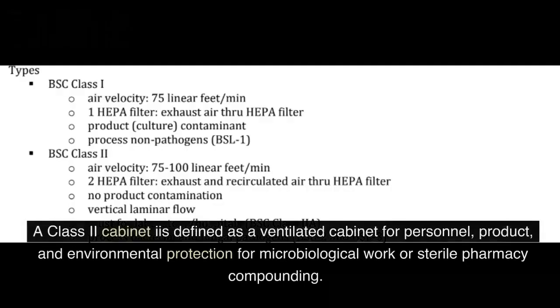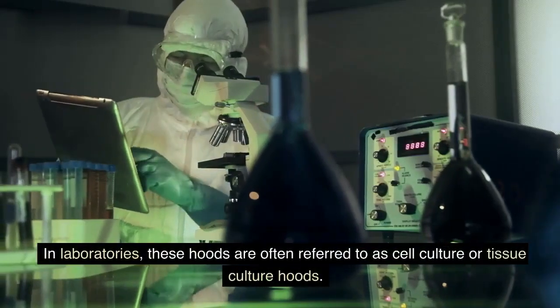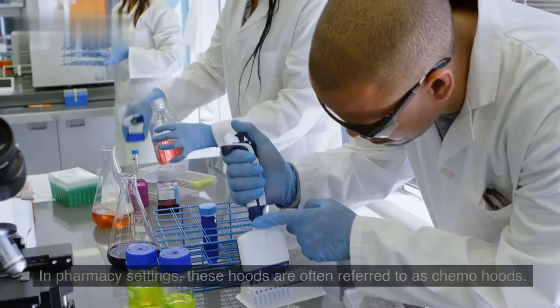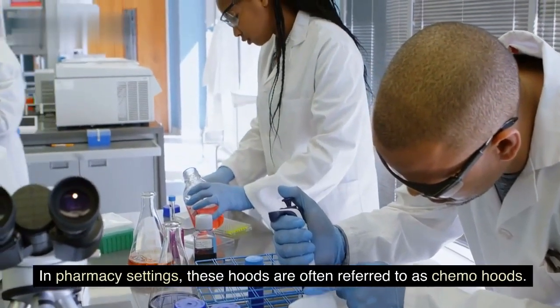A Class 2 cabinet is defined as a ventilated cabinet for personnel, product, and environmental protection for microbiological work or sterile pharmacy compounding. In laboratories, these hoods are often referred to as cell culture or tissue culture hoods. In pharmacy settings, these hoods are often referred to as chemo hoods.